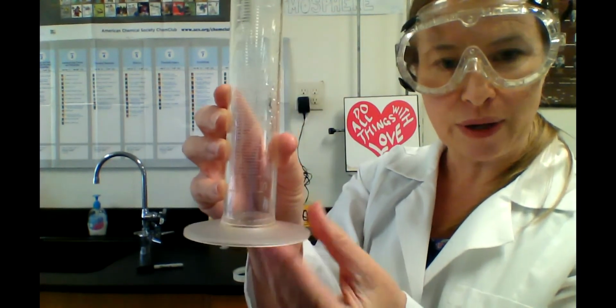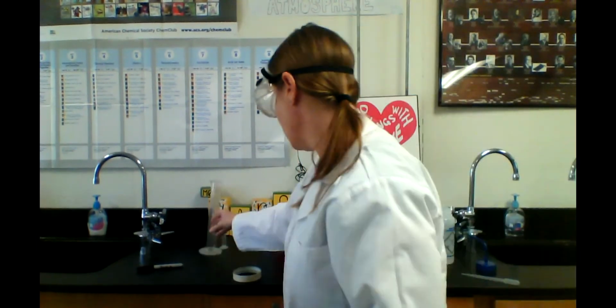Okay, and while we're measuring stock solution, let's go ahead and do the other two as well. So for the 10, we needed 8 milliliters of our stock solution. So let's go ahead and pour. Oh. Okay, this should be a duh moment. We can't use this one because it only goes down to 10. So for 8 milliliters, I'm going to have to switch graduated cylinders, and I'm going to have to use the 10 milliliter one.